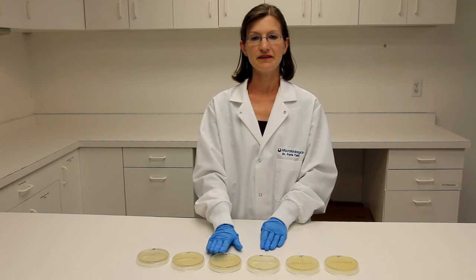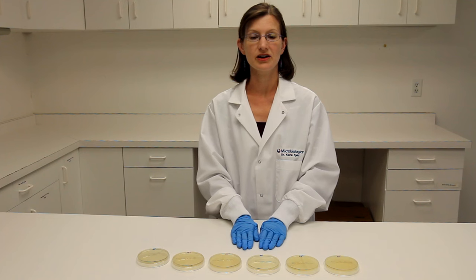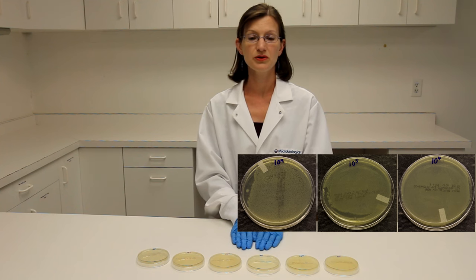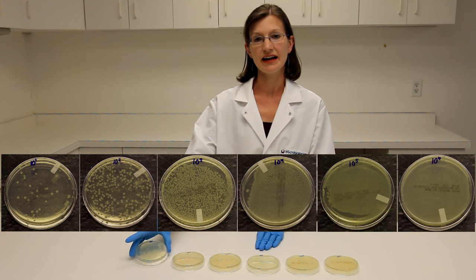These are our plates after the overnight incubation. These results demonstrate why it is necessary to do serial dilutions. Most of these gave us either a full lawn of bacterial growth or too numerous to count colonies. Our final dilution gave us an easily countable plate.